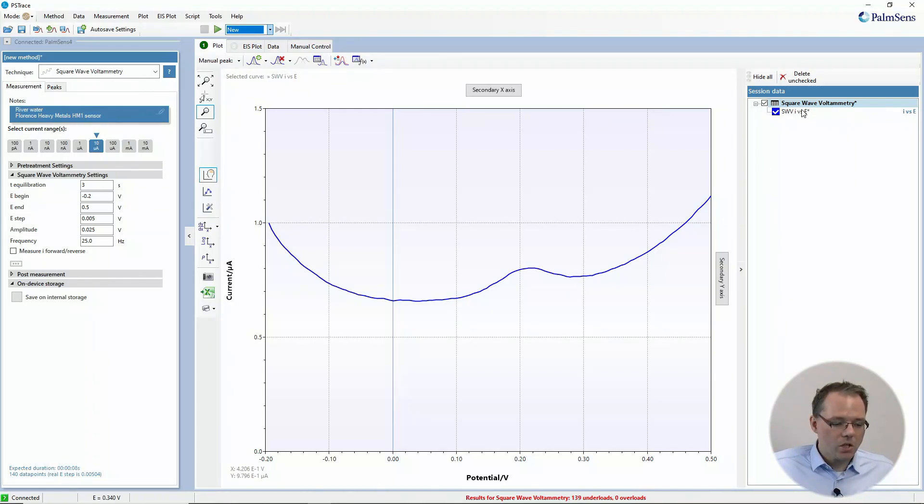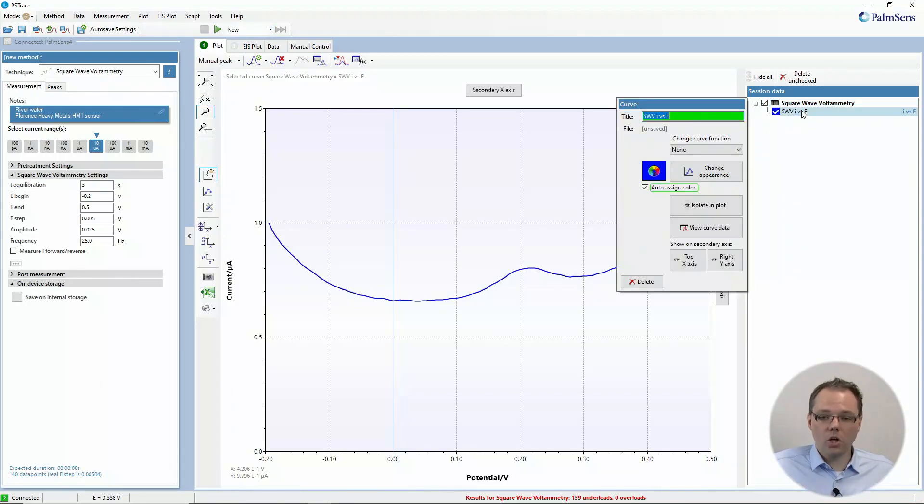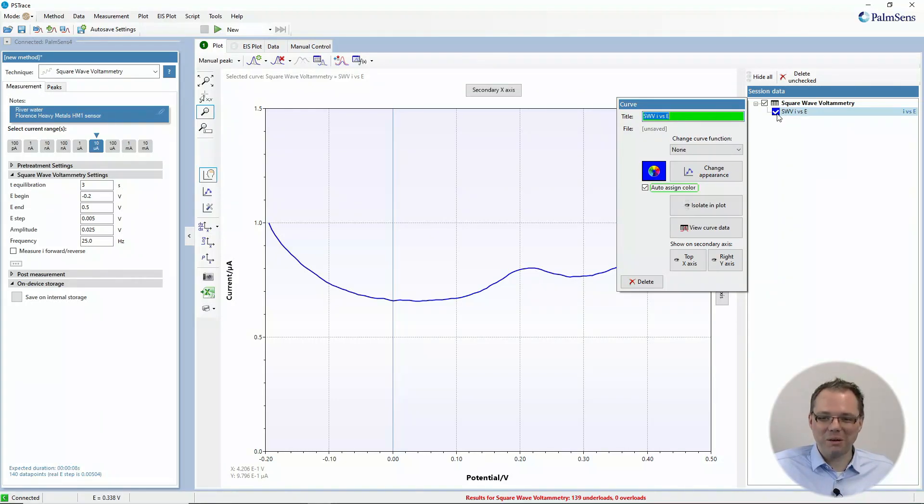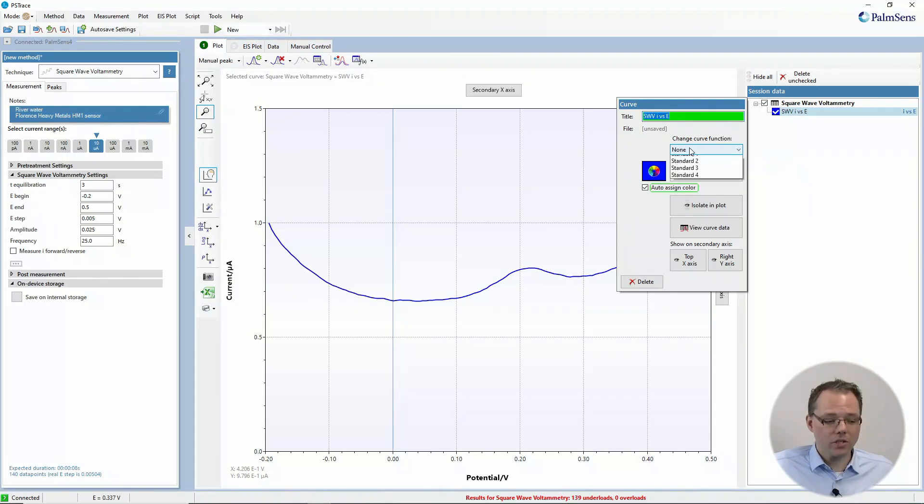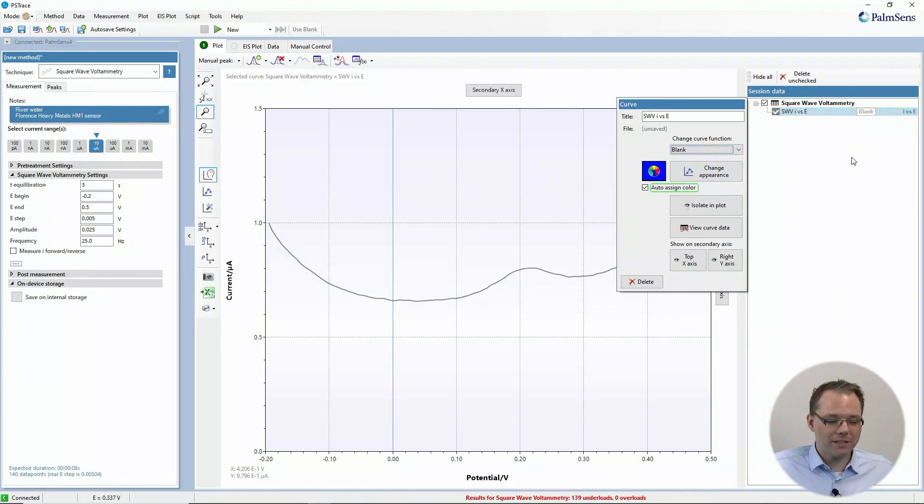If you want to decide after a measurement that this is your blank measurement, you can click on the curve (on the part that has the colorful checkbox in front of it), then choose the curve function, and the function that this curve should have is blank. I do exactly that.